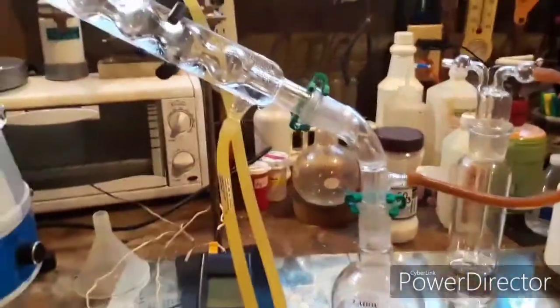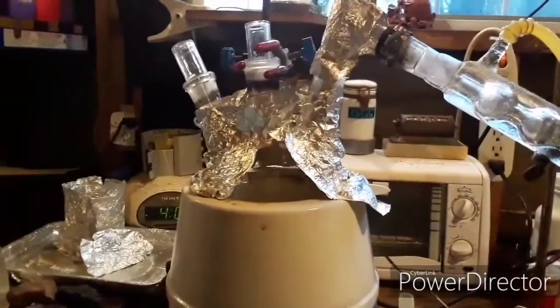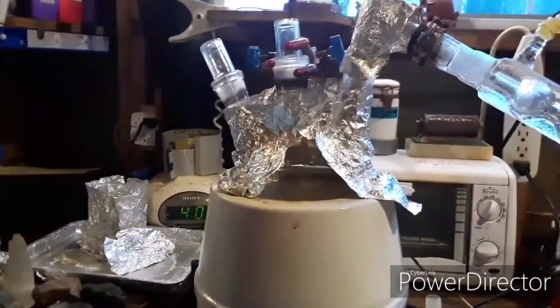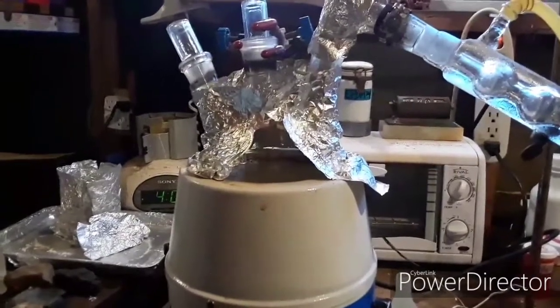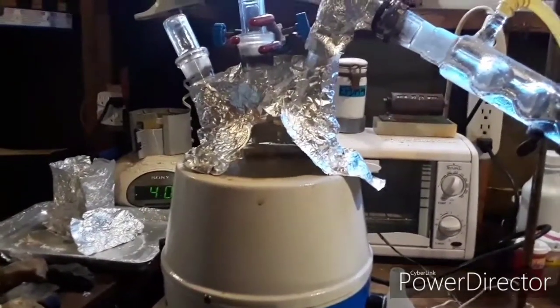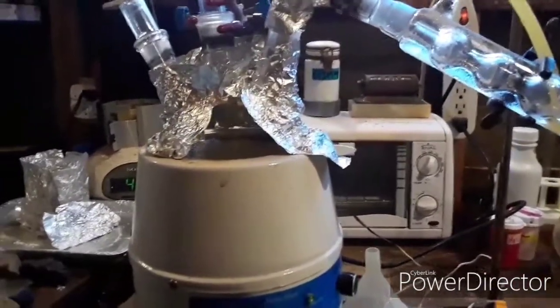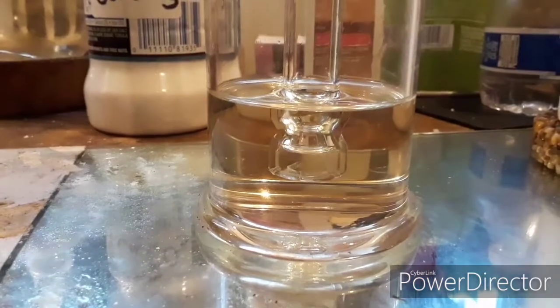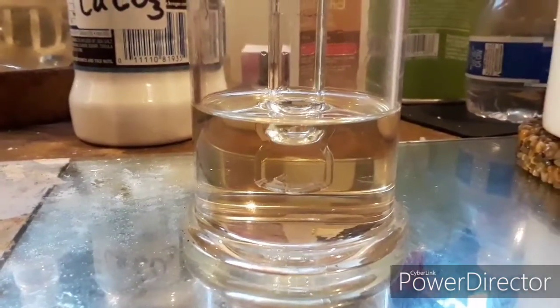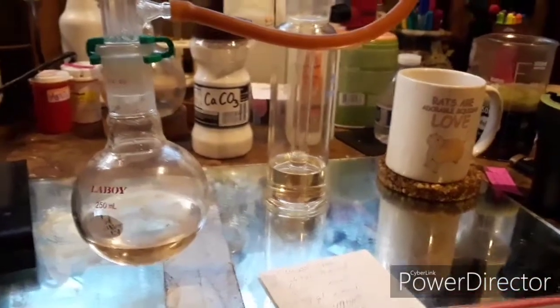So there's a sulfuric acid distillation — I might come back and show you the density reading. I did not use any hydrogen peroxide for this. A lot of people will clean up sulfuric acid by oxidizing it with 30% or greater hydrogen peroxide first, and that's really useful if you've got a lot of dyes and other junk in the H2SO4 you're trying to clean up.